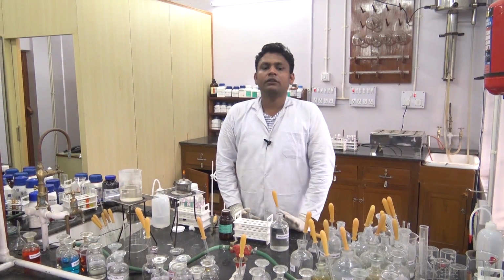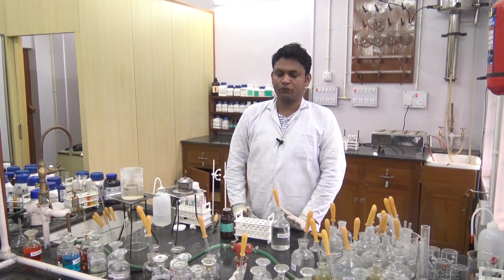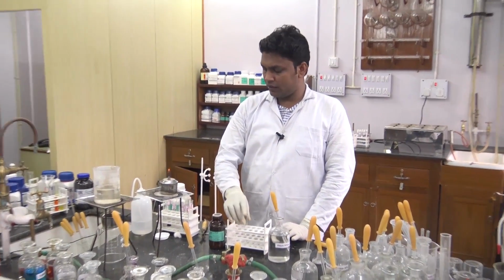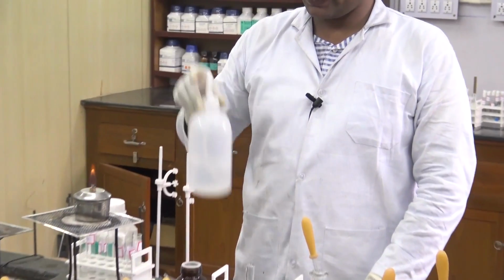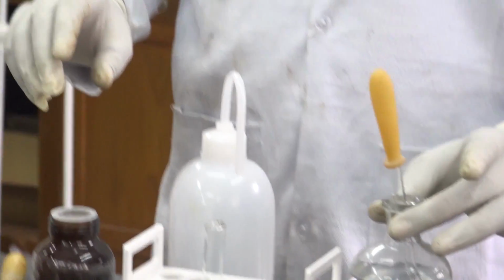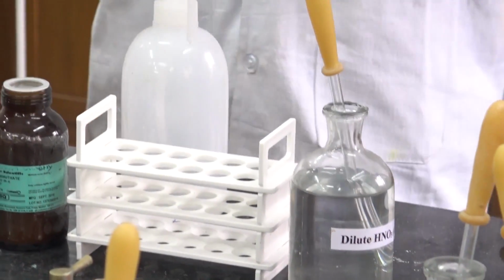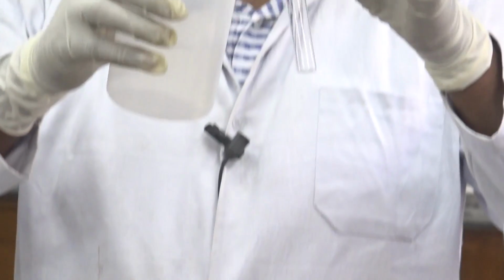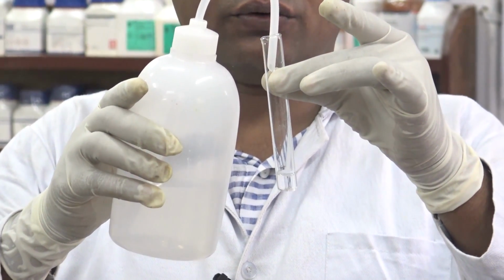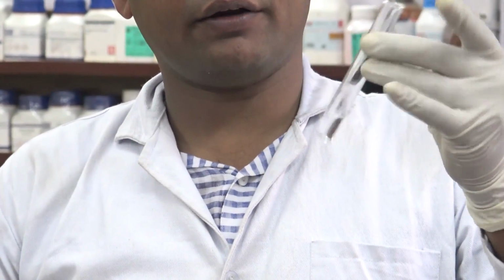Now we will go for the confirmatory test of manganese ion. For this test we need sample, distilled water, sodium bismuthate and dilute HNO3. To go for this reaction, at first dissolve the sample in distilled water.